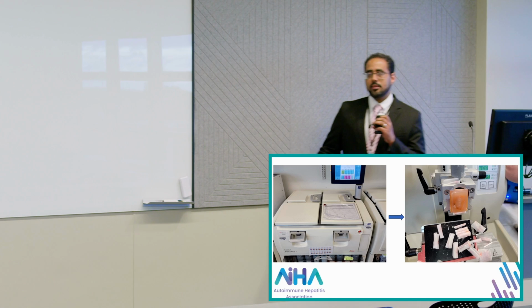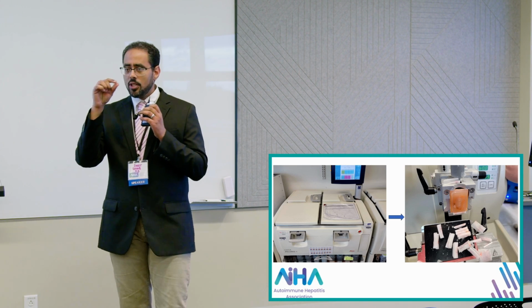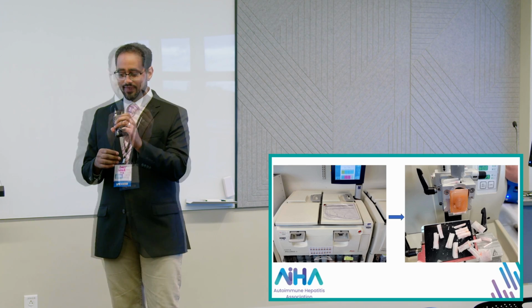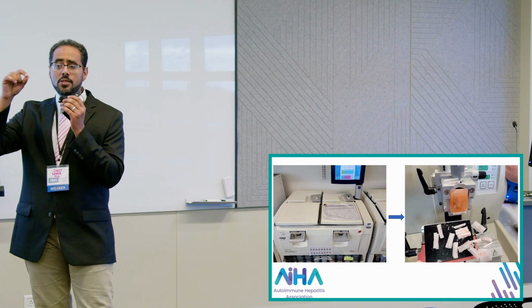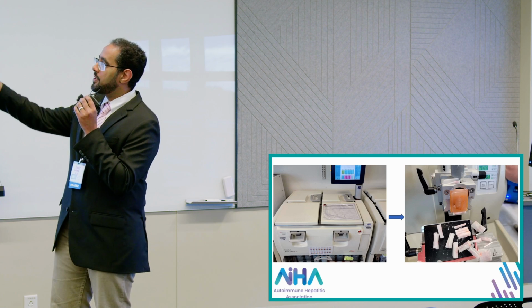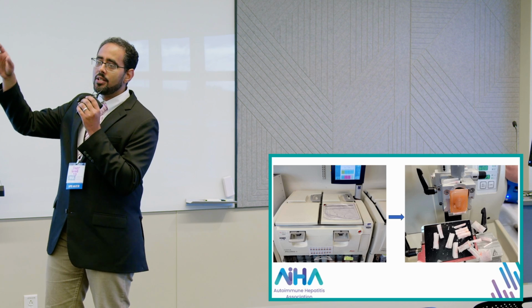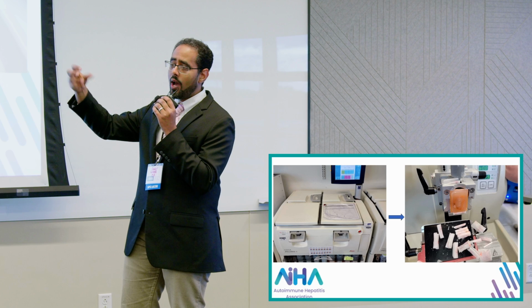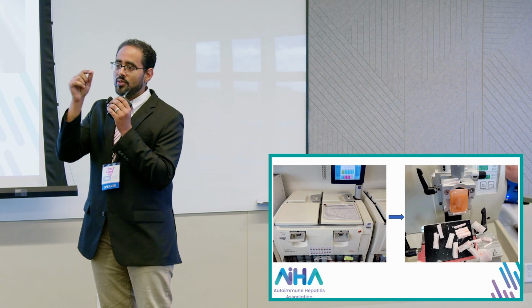The basic principle is to be able to cut the tissue. To look under the microscope at the level of the cell, you need to go to high magnification. To cut a very thin section of the liver, it needs to be stiff, because it's soft tissue. So someone smart, not me, invented a process where the liver biopsy cassettes go into this machine. It takes about half a day. The machine takes the water out of the tissue, takes the fat out of the tissue, and puts some wax in. It's called paraffin. So it becomes a waxed, very stiff biopsy, and then we can cut it.